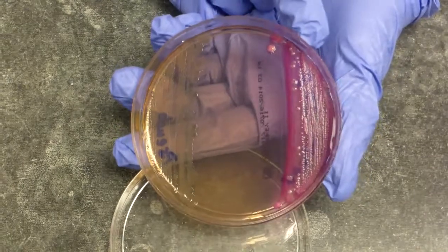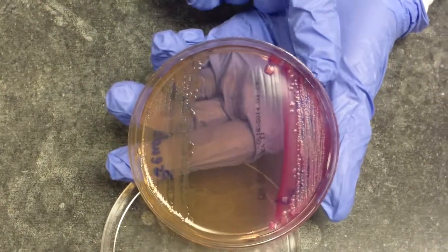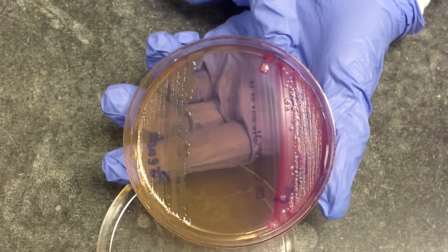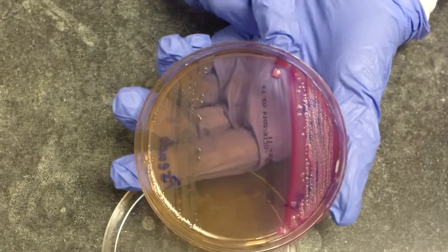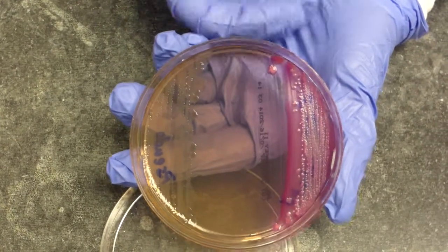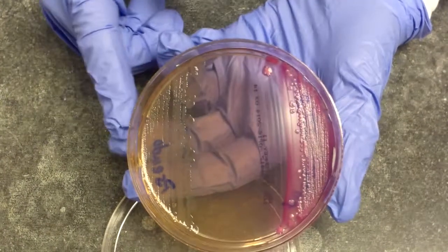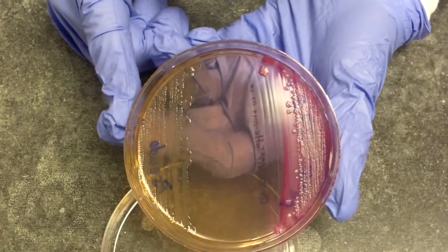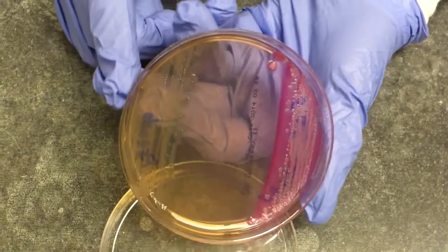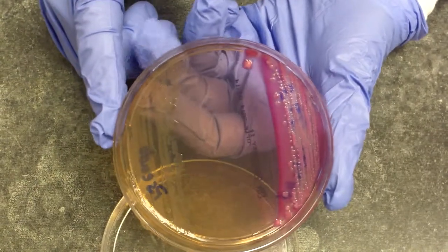When the gram-negative bacilli ferments lactose, you will get a pink color. The organism will actually utilize the lactose, and the dye in the media will be absorbed by the bacteria, and it is a pink color. The organisms that do not utilize lactose or do not ferment the lactose will be clear. And you can see we have a Pseudomonas that is not utilizing the lactose, and the colonies are clear.